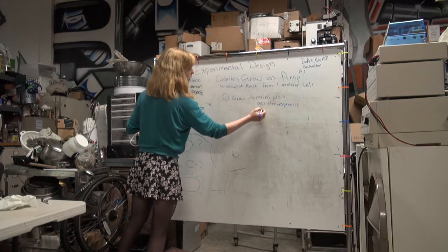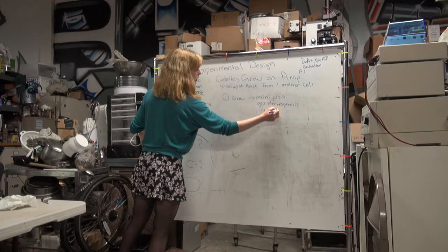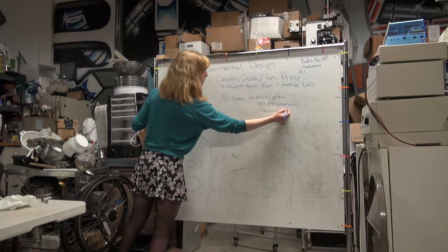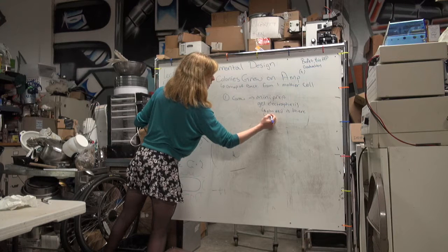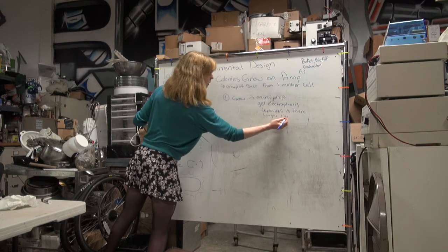This is going to make sure that the plasmid is there. It's also the right size.